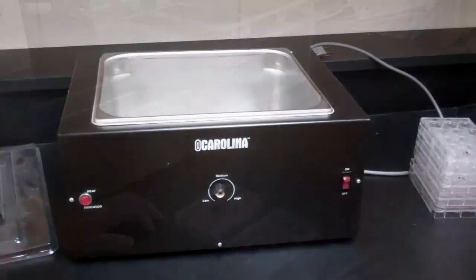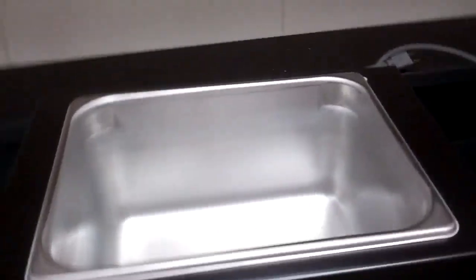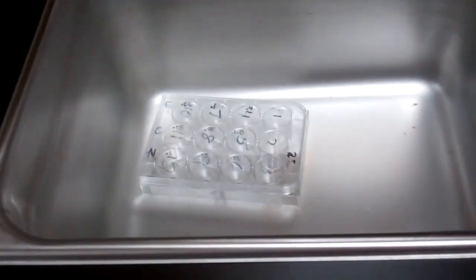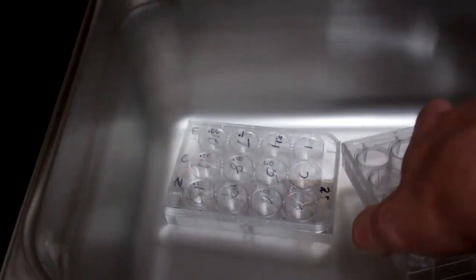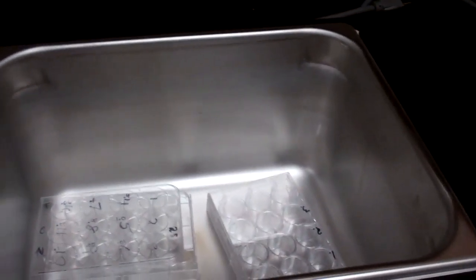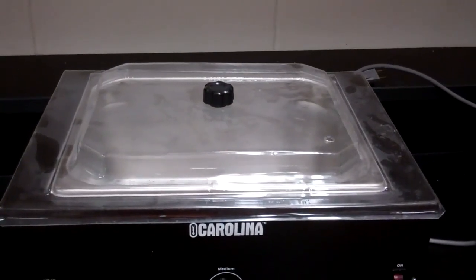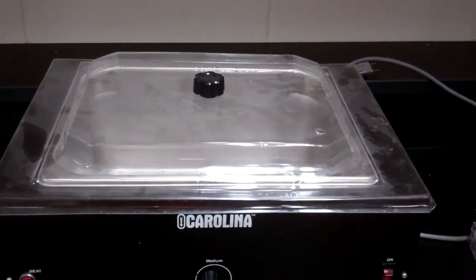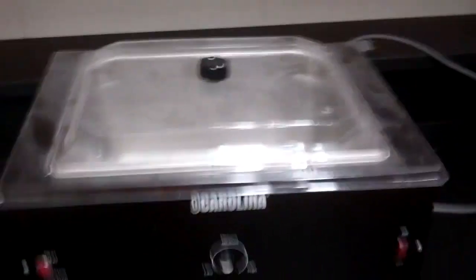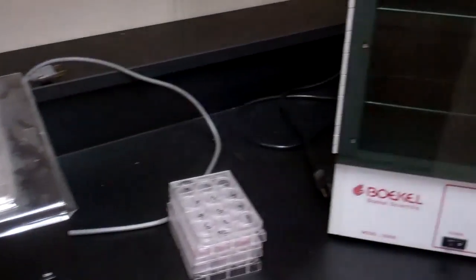These are 2 of the incubators that I used while doing the zebrafish experiments. This first water incubator worked pretty well. I would put the right amount of water in the bottom, put a rubber band on the falcon dishes, and just float them in here. The problem I experienced is that the lid didn't seal well, so it was tough to maintain the temperature. If this is your only possibility, it'll work, but I wasn't crazy about that incubator for this project.